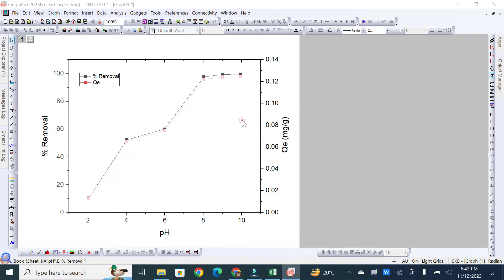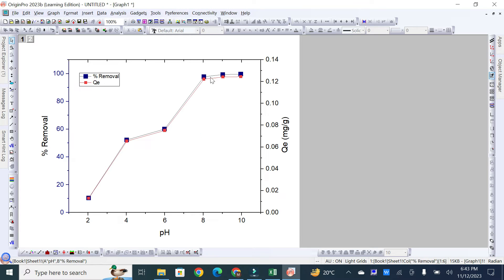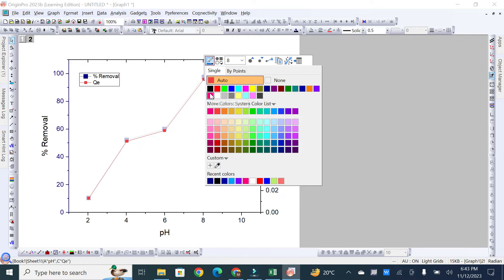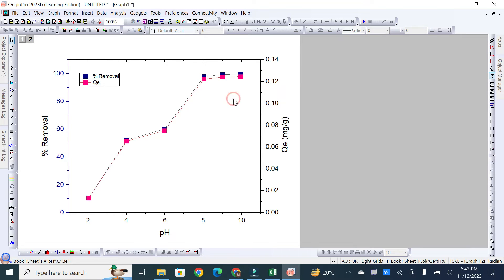For example, you can keep a line as navy. If you want to make a line more highlighted and increase its width, you can select size 12 or 18 — selecting 12 will increase the point size. For the other line, you can change its color to pink and increase its size to 12 so the points become larger. In this way you can change the color and style of your graph.